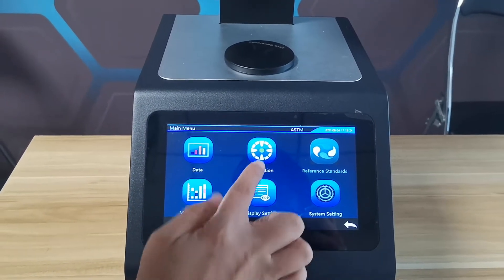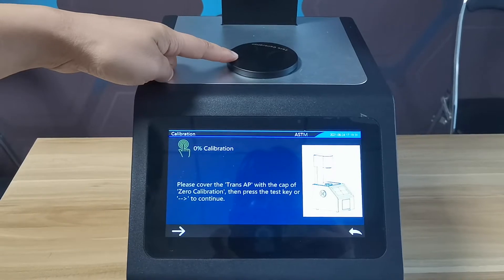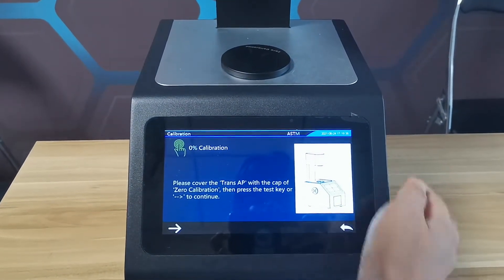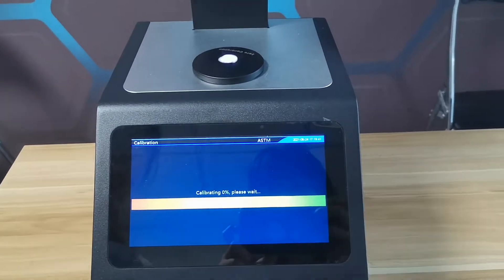First, calibration. This is the calibration cover. Then, press the measurement button.